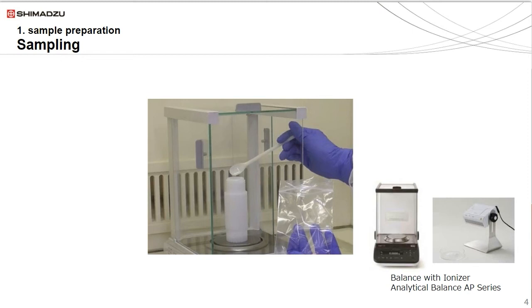Weighing samples into Teflon vessels can be tricky. Static electricity causes powders to disperse. Transferring weighed samples to the bottom of the digestion vessel is critical for accurate analytical results. Powder that adheres to the top of the vessels may not digest in acid or end up in the sample dilution, even though it contributes to the weight of the sample.